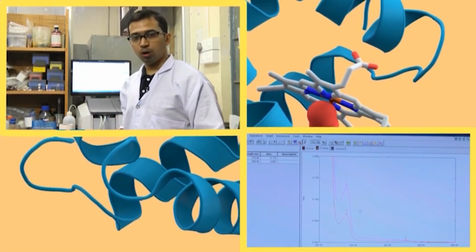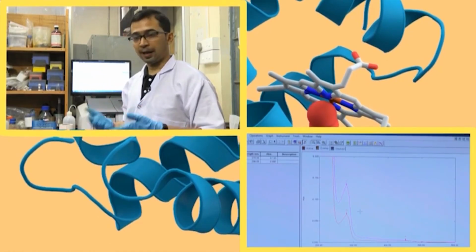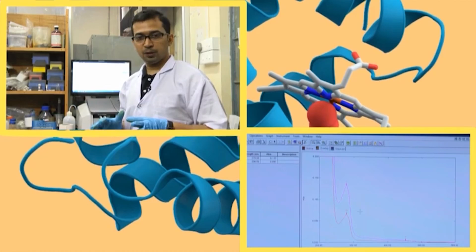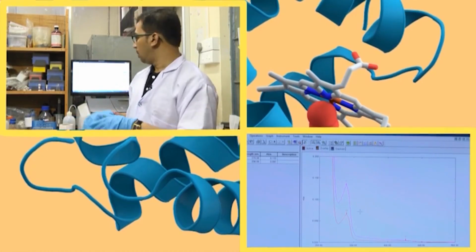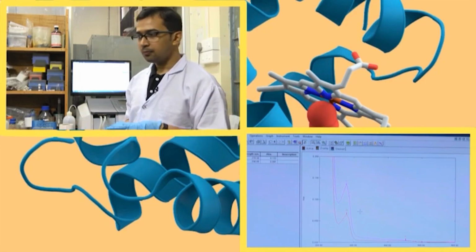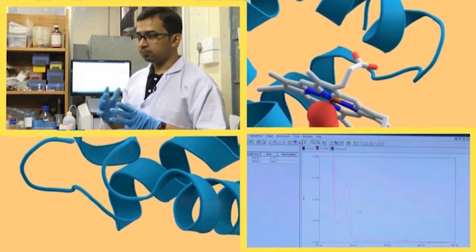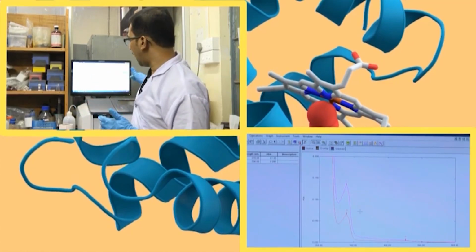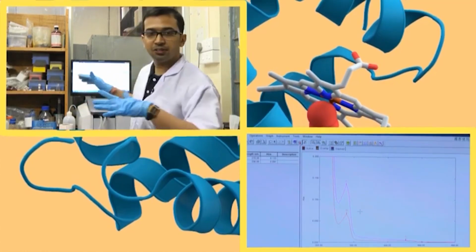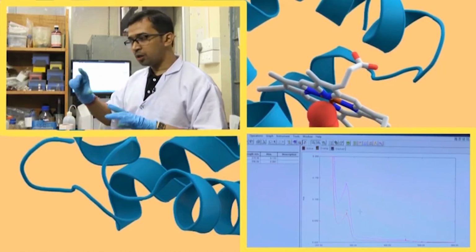You can keep it slow also, and for slow scan speed the absorbance value is much more accurate, whereas for fast scan speed the absorbance value is sometimes accurate, sometimes not, but here we are keeping it at medium. Now, there might be some correlation with the rate of this absorbance measurement, because while the measurement is going on from 600 to 200 nanometer, within that time the solution is kept still.